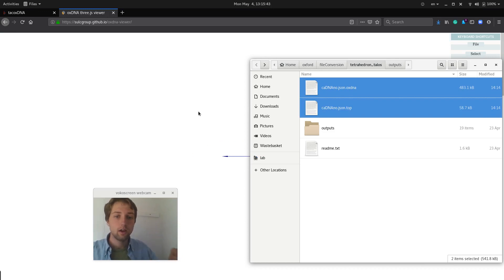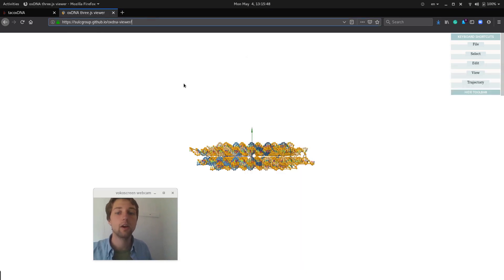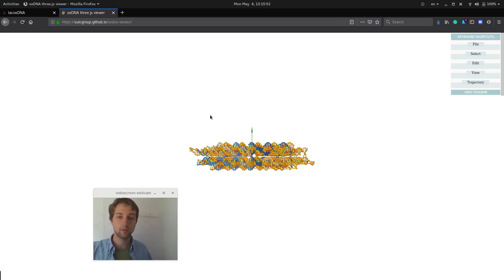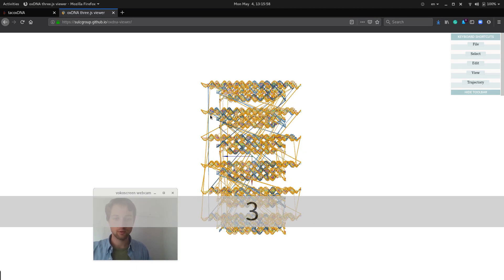So if you go to sulcgroup.github.io/oxdna-viewer, you will get the most recent version of OxView all the time. Here we can click the numpad to directly go to this top view.